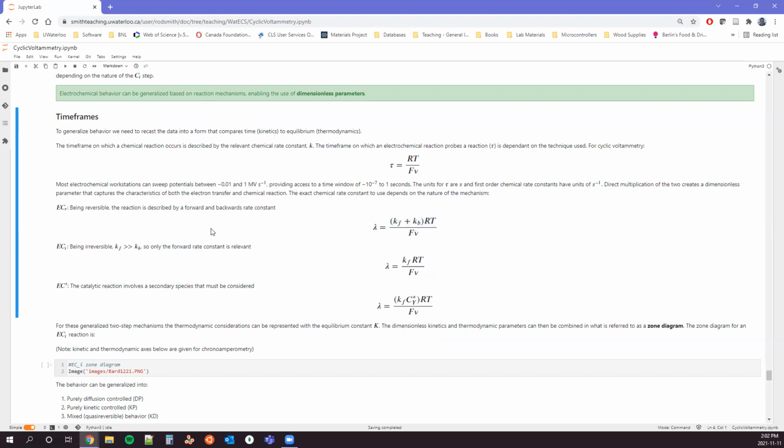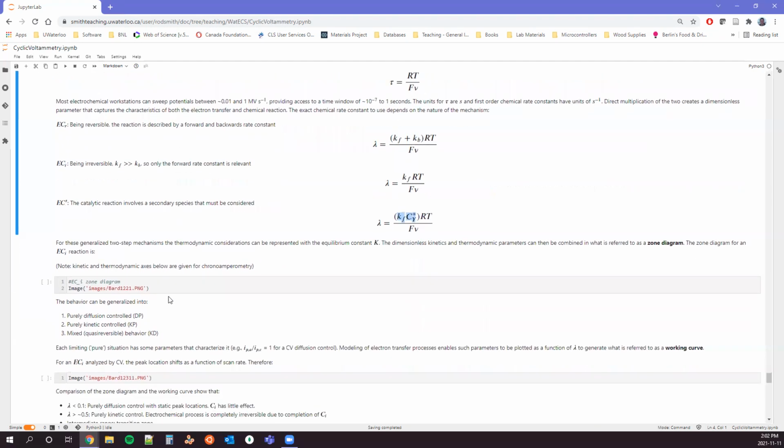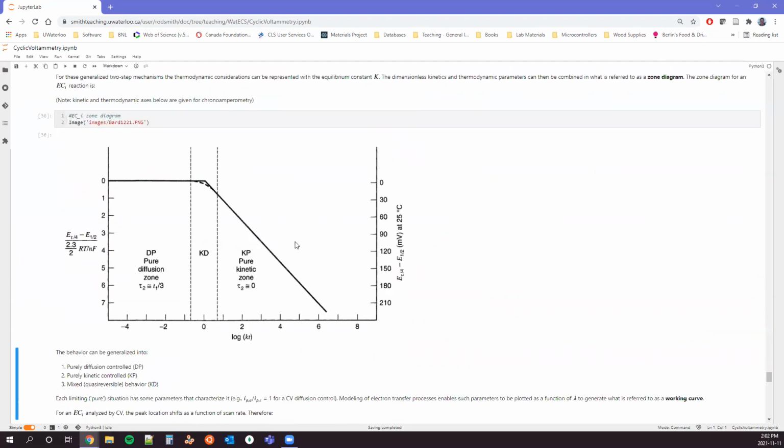As we change the nature of the reactions, we have to change how we define this a little bit, right? And so for a reversible system, we would consider forwards and backwards. For irreversible, we only need forwards. If we're doing catalysis, the concentration of the species with which the redox generated species is reacting becomes important, right? And so we tune that a little bit based on what we're doing. Where it's generalized, we can start looking at behavior like this.